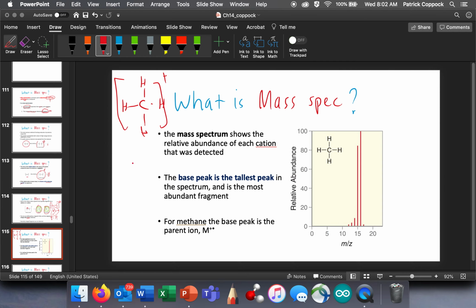This weighs 12 plus 4. No, 12 plus 4 is 16. That was bothering me. I'm looking at this graph over here and I'm looking for 18. It's really bothering me. There it is. 12 plus 4 is 16, right? And sure enough, there's my 16 right there.